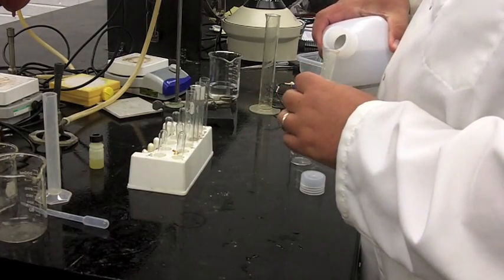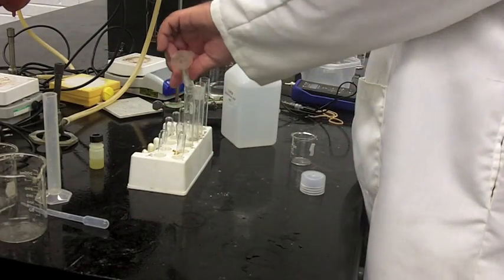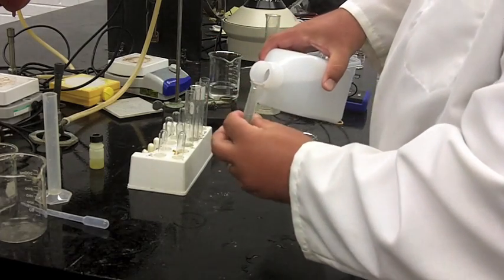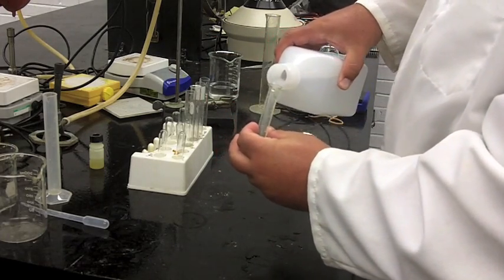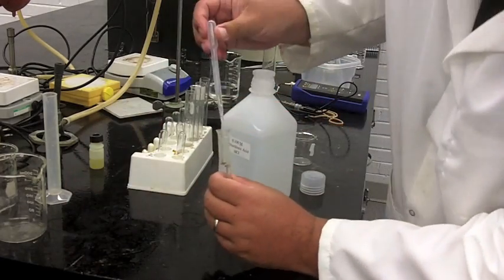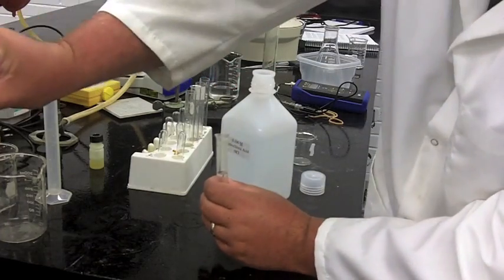And so they kind of discuss how you're going to rinse out the graduated cylinder when you use it. Eventually, you're going to make these dilutions. You'll pour them into the large test tubes, and then you'll make a new series of it. You want to be careful with the drops. So you notice I've got a drop there at the top of my graduated cylinder, but you'll also see that I am able to sort of push that down. So be careful when you're diluting things.